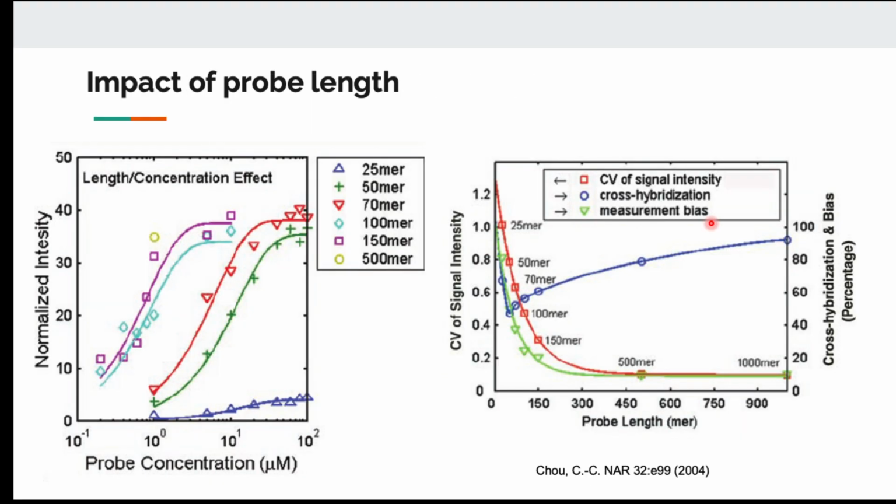Okay. What I want to show you next, these are very old, you can tell from the font. These are studies from back when people started to develop microarrays. They had a lot of questions that they needed to optimize.